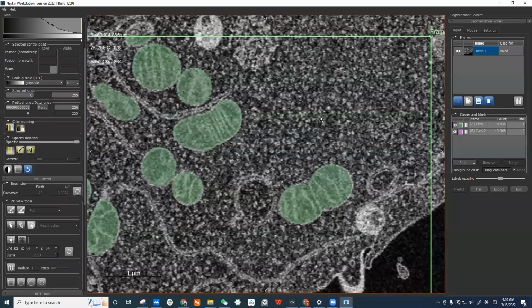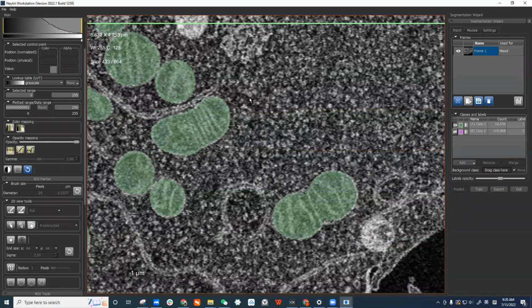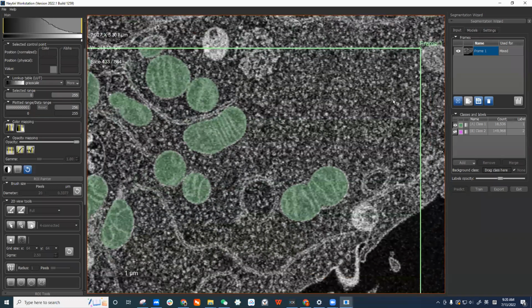I think eventually we will have a grid on screen to show the size, for example a grid of 64 by 64, or we can change the grid size to 128 by 128. That will help us find the proper patch size. But now we don't have the grid. That's why I use my brush, because I know the size of that.